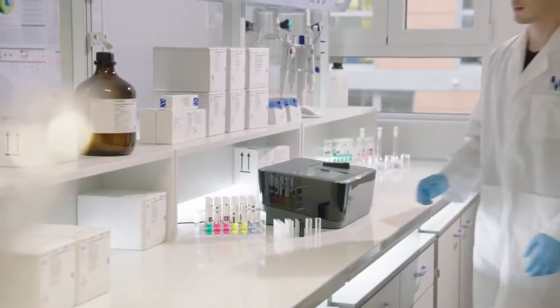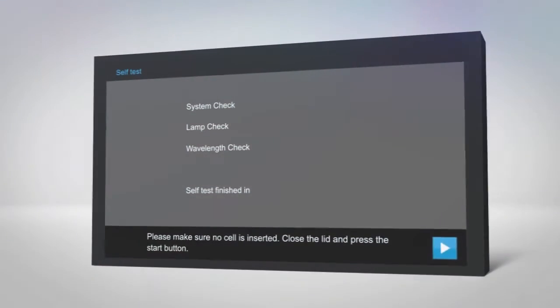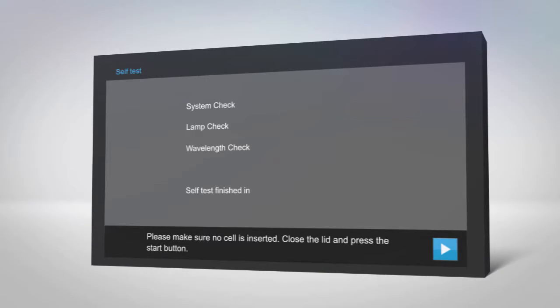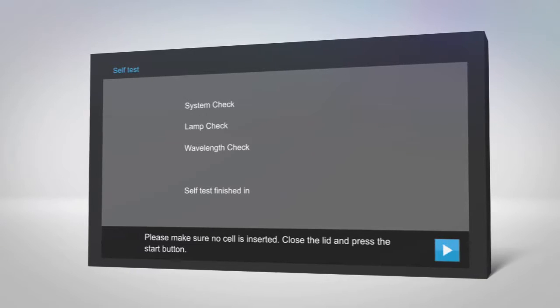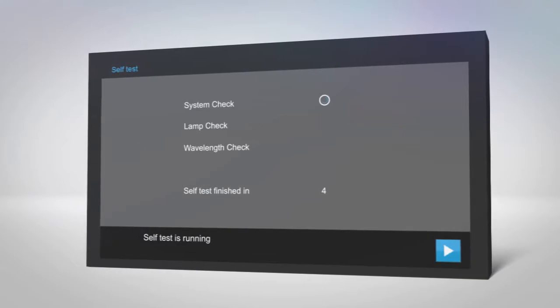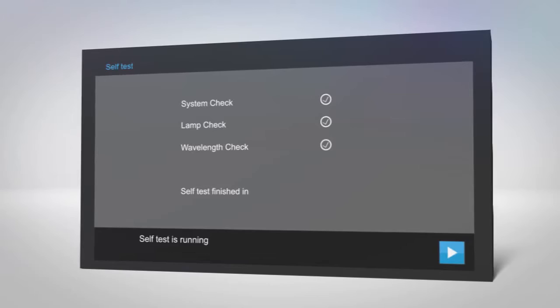To begin, click the ON switch at the back of the instrument. The program will take a few moments to start. When the software is ready, you will be asked to check for any remaining cells. Please make sure that there are no cuvettes inside the instrument. Close the lid and press Start. The instrument will then run an automatic check on the operating system, lamp, and wavelength accuracy.